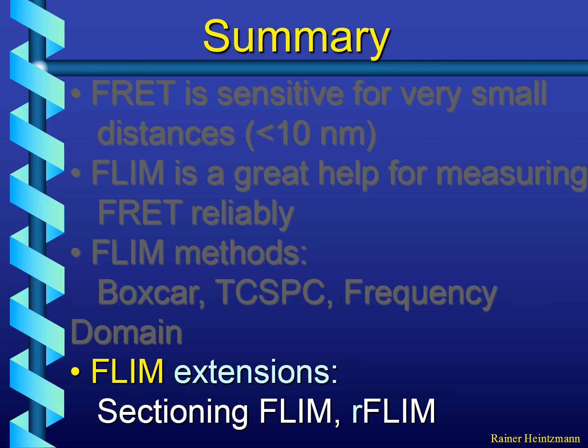There are extensions of FLIM. I didn't talk about them a lot, but there's also a sectioning version of FLIM with a confocal microscope. There's rFLIM, as you've seen. There's a spectroscopic version of it as well, which shows you the lifetime of every spectroscopic component of every emission wavelength separately.